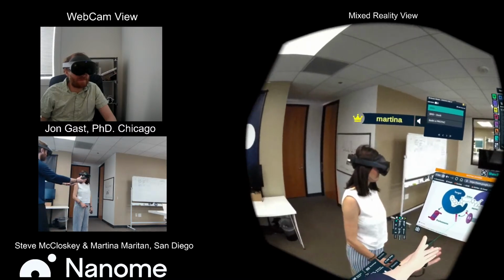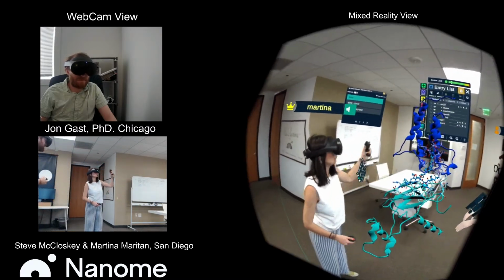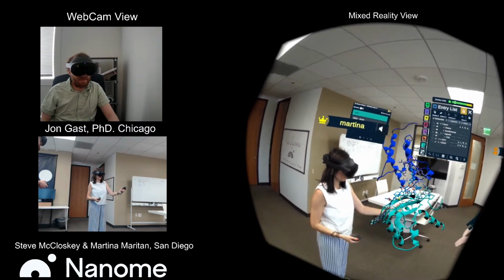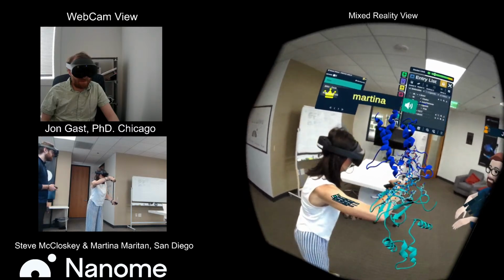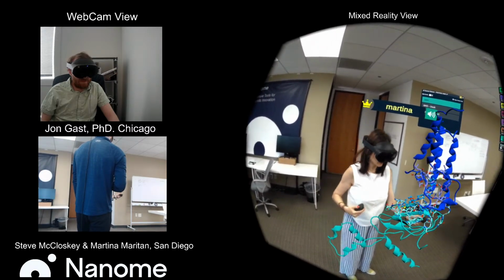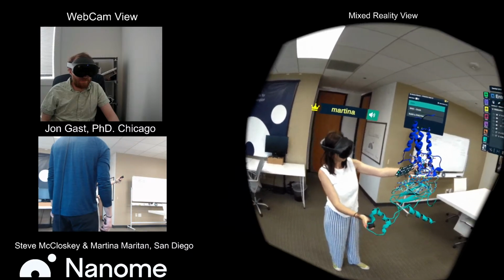Yeah, fantastic. Thank you for that explanation. And of course, we have the structures. What else were you saying about that? Yeah. So just to give some vision here, as I was saying, SMARCA2 is going to be this blue one. The E3 ligase is going to be here in teal, and the PROTAC is the small molecule right here, and so we can already distinguish the part that binds on SMARCA on the bromodomains and the part of the PROTAC that binds on the E3 ligase and this linker here that brings this ternary complex together.